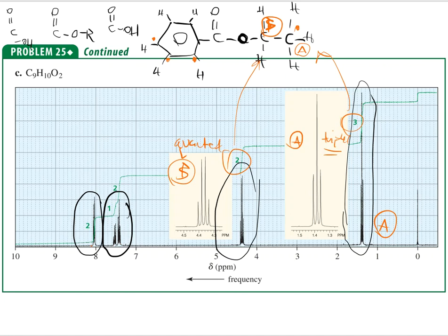I kind of was iffy about those 2 that are nestled together pretty close, but they probably are separate. I can't actually see how those are splitting up, and because of that, I don't want to go through the whole calculation of the splitting or the multiplicity of those shifts. However, look at this.